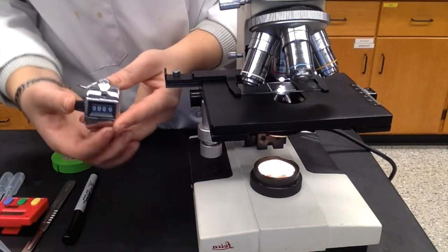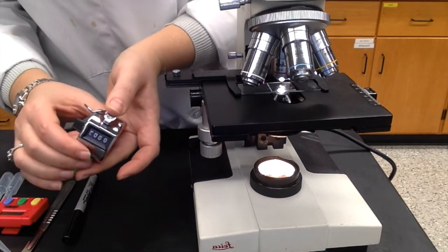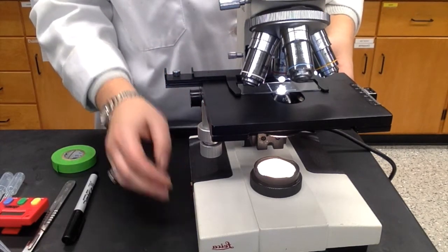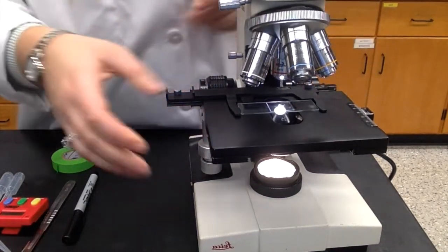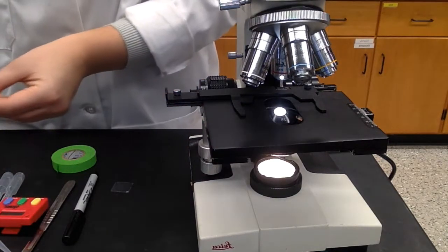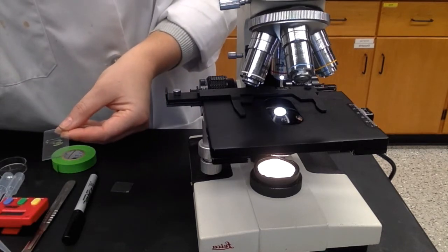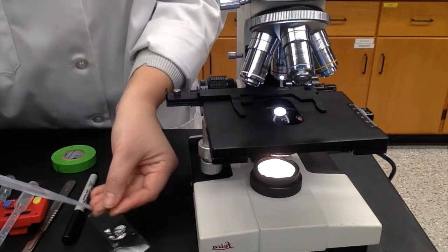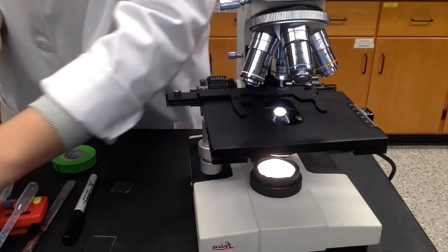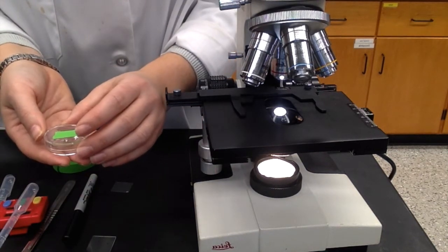When you're going to count, you can use this counter that you have to count your segments, by clicking and depressing, and you'll see that the numbers change. If they're moving really slowly, you can just count them out to your partner. Get your baseline and record. As soon as you're done recording, turn down your light source, lower the stage, remove the slide, and place your segment of your worm into its labeled holding chamber, the smaller of the Petri dishes, and use water from your collection tube to wash the worm into its holding pen. This is where it will rest until you're ready to begin all the remaining trials after the worm has been soaked in its designated chemical.